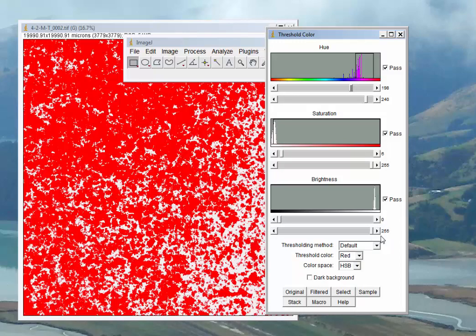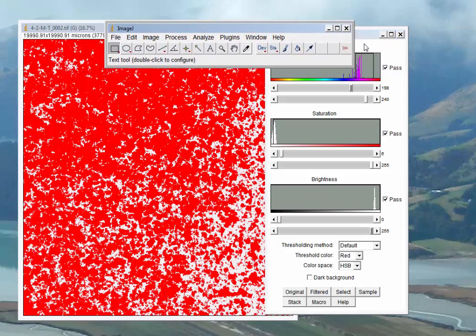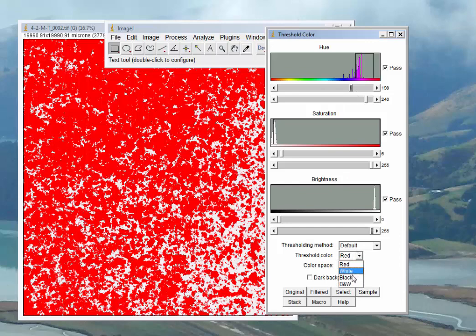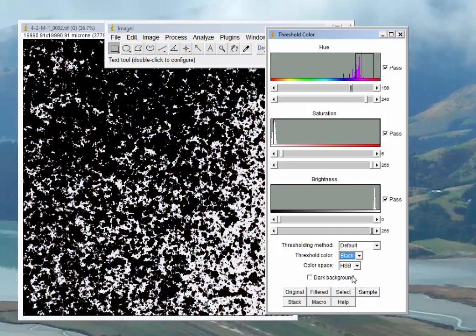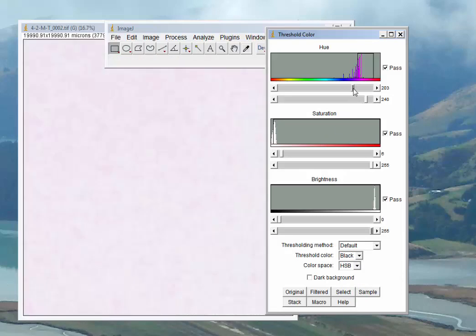This is where the art comes in. We can see this magenta range here getting up into red. We're using a threshold color of red here. I'm actually going to choose black for this exercise. The reason is that as we change these slider bars, I want to see if there's any magenta left in the background.